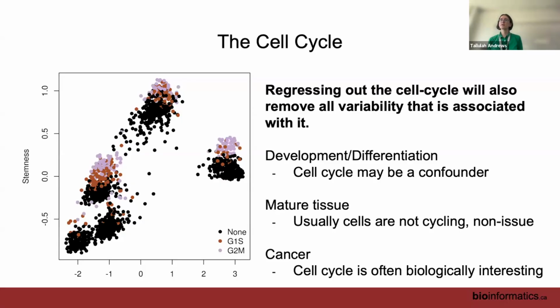Yes, so you can include lots of covariates for normalization in SCTransform. In theory, it works well. In practice, we've actually noticed the regression function of SCTransform for things other than library size don't necessarily work all that well. We're not entirely sure why. We've just started testing it and we've seen that it does correct for it, at least in part.